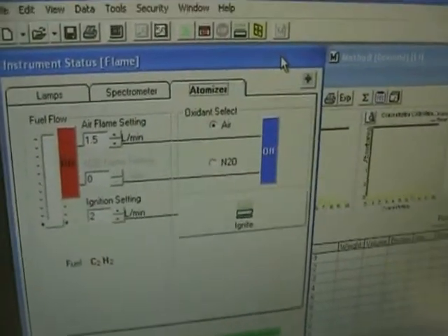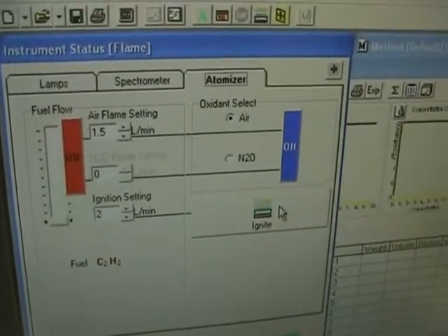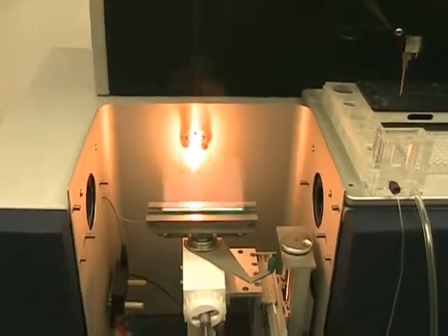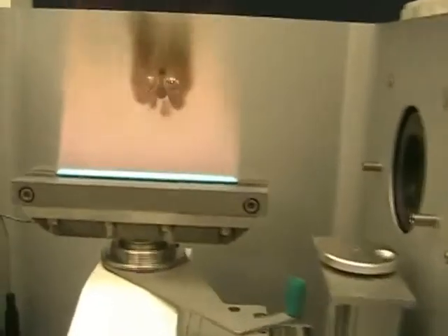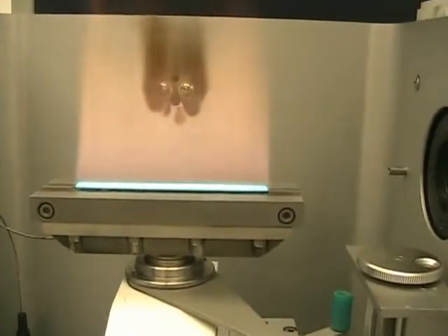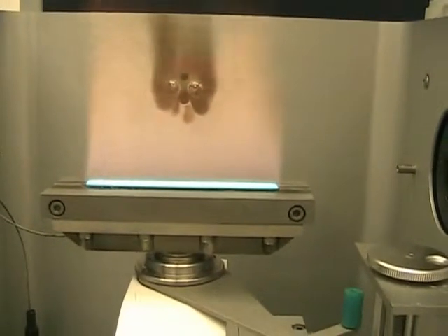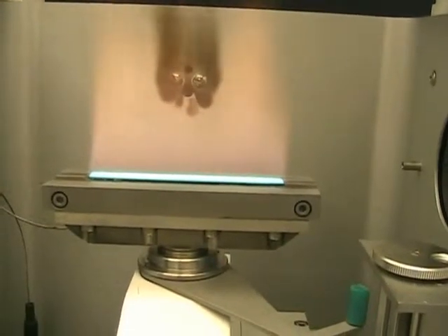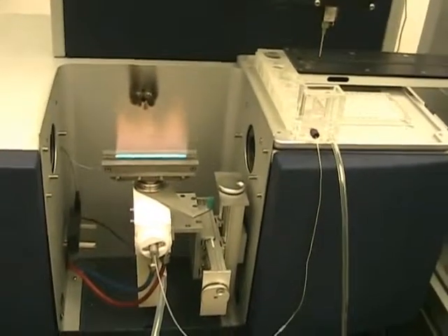We're going to go ahead and fire this up. We'll go back to the atomizer window and hit the ignite button — as soon as you hit the button you can hear the flames kick up. Moving over so you can see it actually light: it builds the gas pressure and ignites the flame, then settles down to a really nice, beautiful straight flame. That's mostly because we cleaned the burner. Sometimes it takes a couple of minutes — you're actually supposed to burn it for a few minutes first before running samples.